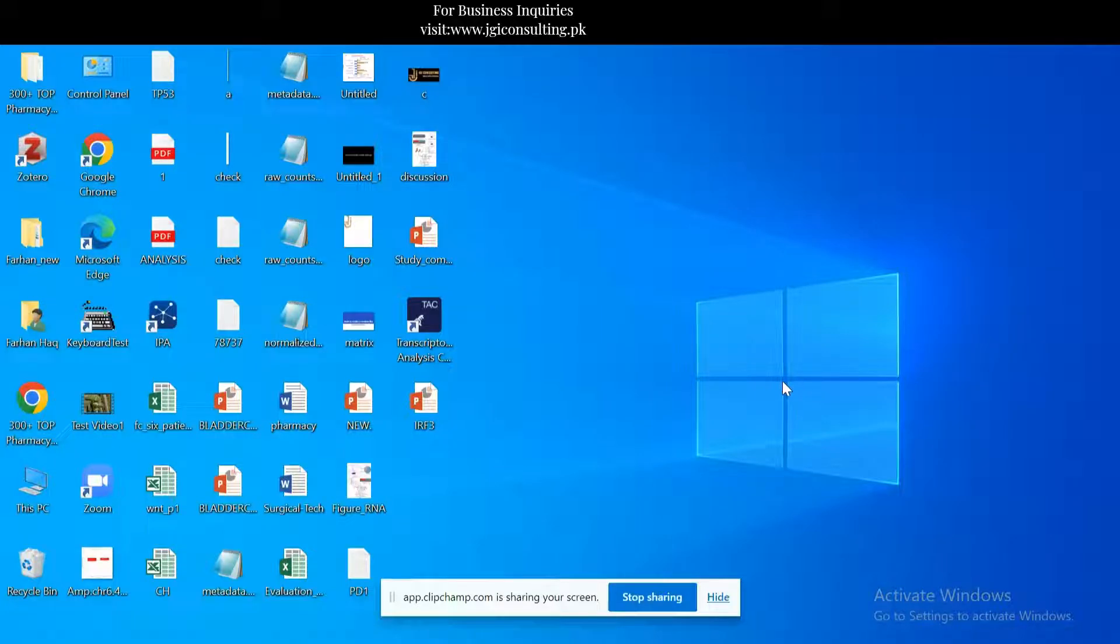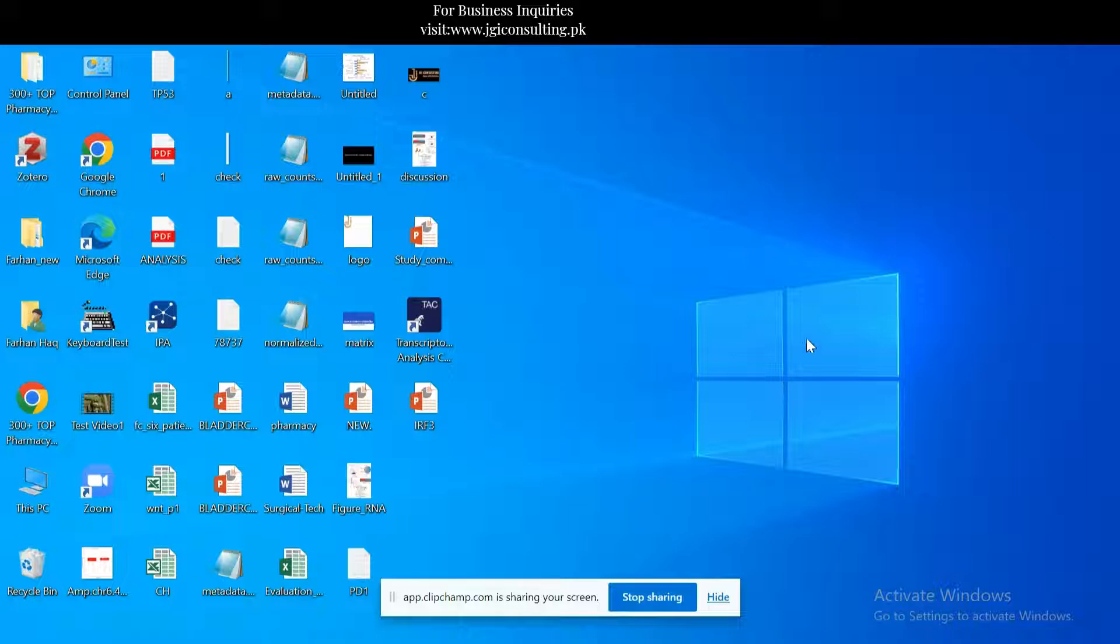In this tutorial, we will talk about another interesting software to analyze microarray data of Affymetrix platform. This tutorial is very helpful for biologists who don't have any experience with R scripts and other programming languages.